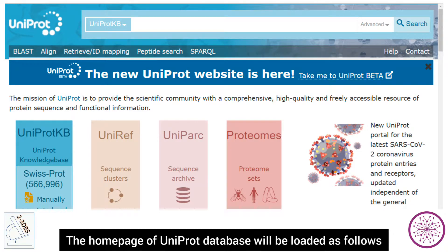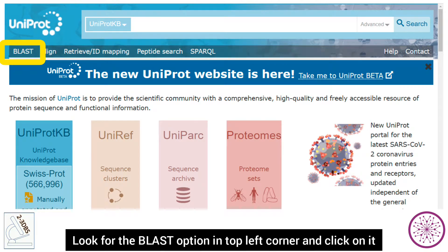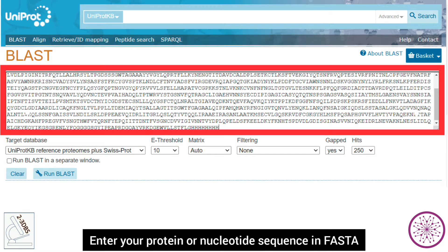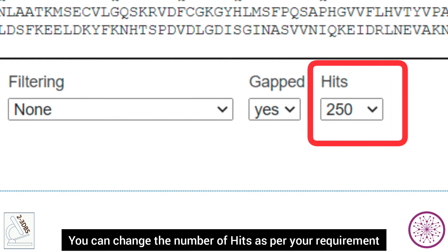The home page of the UniProt database will be loaded. Look for the BLAST option in the top left corner and click on it. The BLAST tool page will appear. Enter your protein or nucleotide sequence in FASTA format.